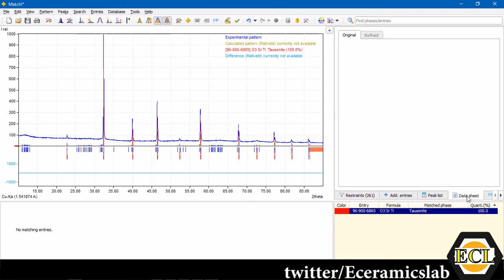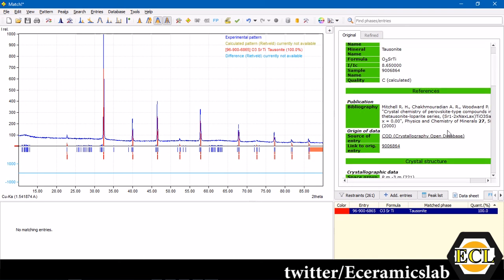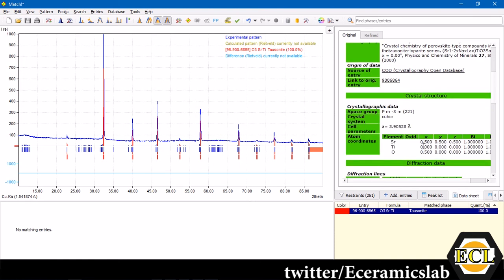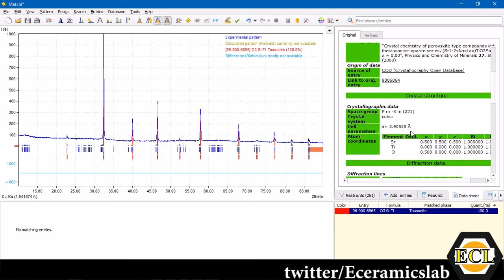Here you can see, go over to the data sheet and you can see the information provided in this entry. Here you can see the formula for the reference is strontium titanate and it has been published in Physics and Chemistry of Minerals in 2000.